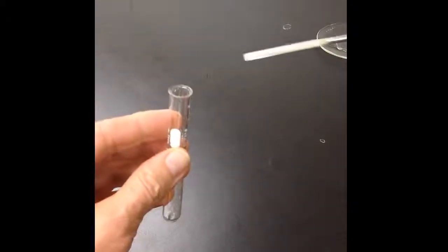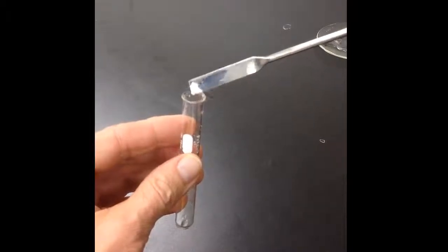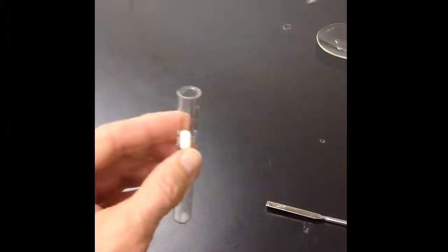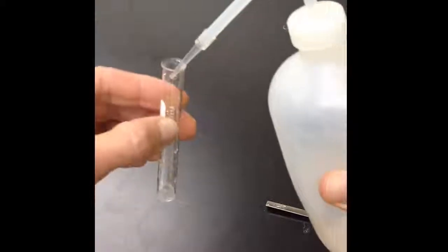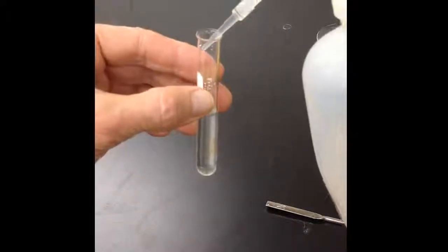Take a second portion of each sample, and place a small amount of that in a 10 millimeter test tube. Fill the test tube about half full with distilled water, which is a polar solvent. You may stir the test tube by flicking with your index finger as illustrated here.